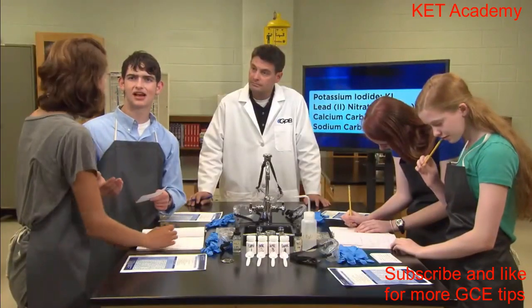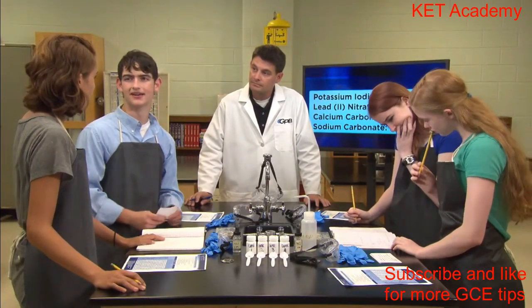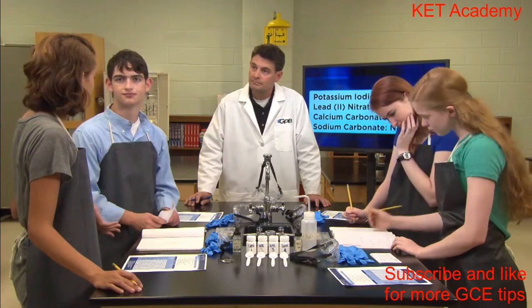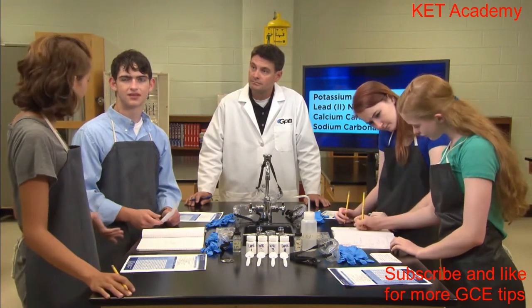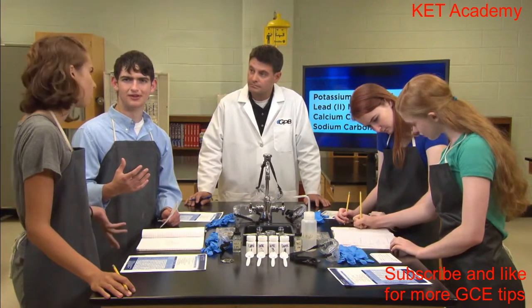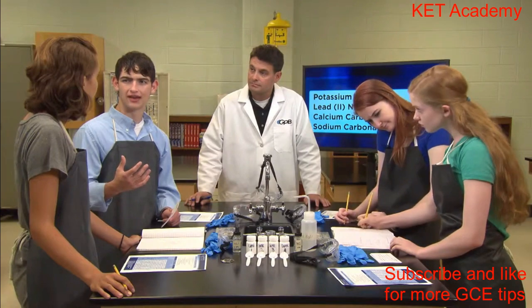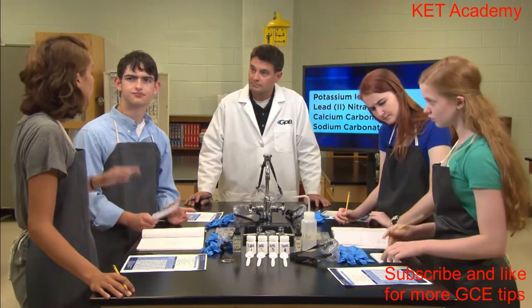The next test uses hydrochloric acid to react with carbonate and form carbon dioxide. How will we know if carbon dioxide's formed? Isn't it a clear gas? Yeah, but the gases will make bubbles in the solution. But wouldn't the hydrochloric acid test also work like the chloride test to show lead? I think you're right. We'll need to watch out for that.